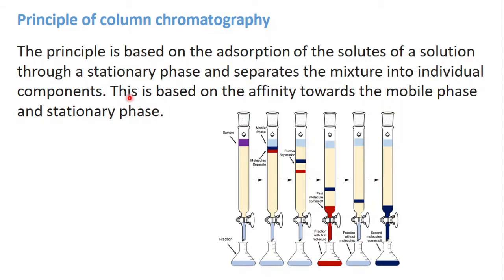And the principle is similar to what we have seen in TLC. Components are separated based on their affinity towards the mobile phase as well as the stationary phase.